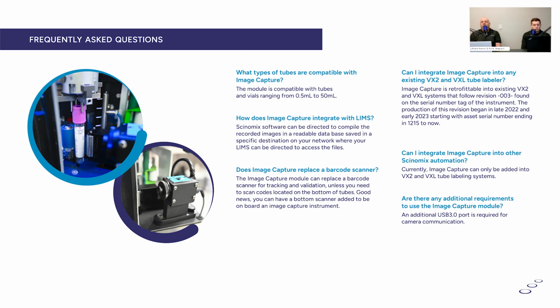So you should look for a USB 3.0 port, and there's an easy way to look for it. Either right around where you're plugging it in, right above it, it'll have the letters SS, or if you look into where you plug it in, if that bar is blue, you know that it's a USB 3.0 port. I would say newer PCs or laptops, all of them have it.